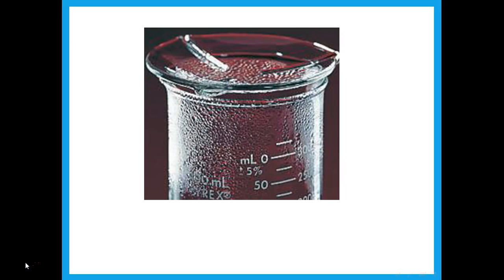Usually in this course they will mention it when we're talking about heating a liquid that evaporates easily, which we call volatile liquid. If you're heating a liquid like ethanol, which evaporates easily, you will probably want to put a watch glass on top of the beaker. This is to avoid evaporation of the liquid.